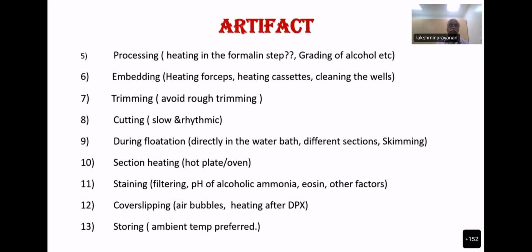And heating after DPX, they mount the section, then immediately keep it in the oven for 5 minutes and then take it out. There will be a lot of air bubbles introduced by that time. This should be avoided. Then for storing, ambient temperature is preferred. At least don't store the blocks and slides in the terrace.